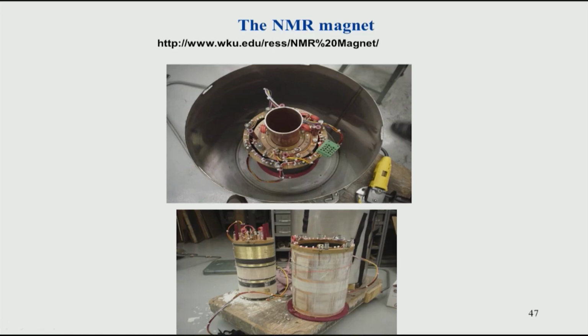It is very difficult, we have to make sure that there are no joints, because joints generate resistance, and that will create problems when the current starts flowing. This is a very fine technology, and these coils are typically about a few feet long, and that is inserted into the innermost container. So, you see this container here which is surrounding this coil is the innermost, and you fill liquid helium around this, and liquid helium basically keeps this whole current and the coil in the superconducting state.